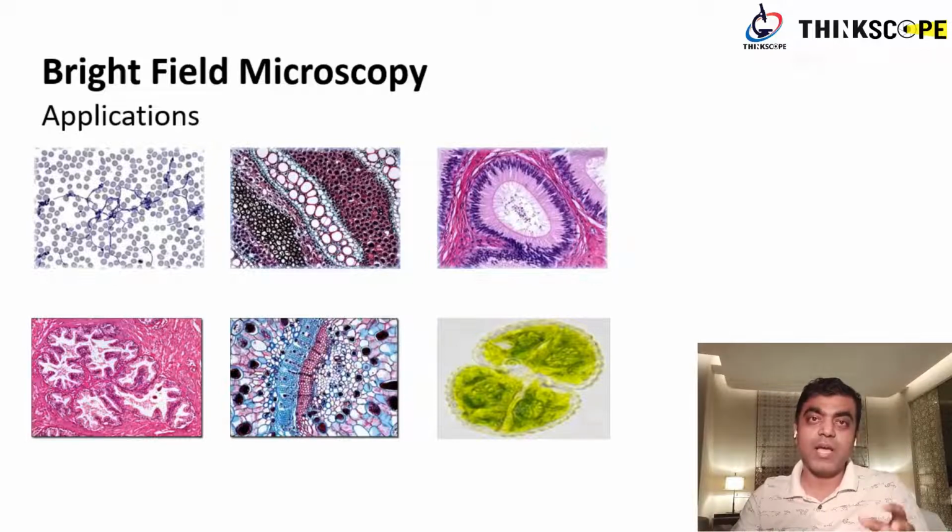So if you have a pathology lab, you give your blood, your urine, your stool samples, right? A pathologist will put it on a glass slide and stain it with common stains, Brightfield stains, okay? And you see different colors attaching to different body parts.